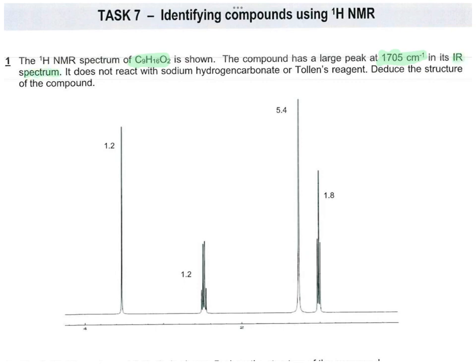The chemical information that's been given to you is that it doesn't react with sodium hydrogen carbonate or Tollens reagent. Deduce the structure of the compound.